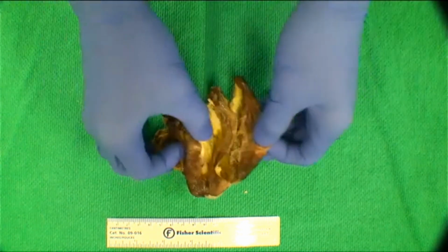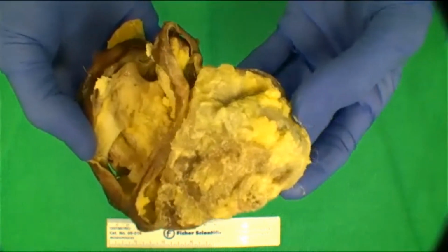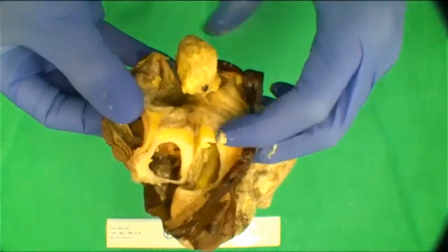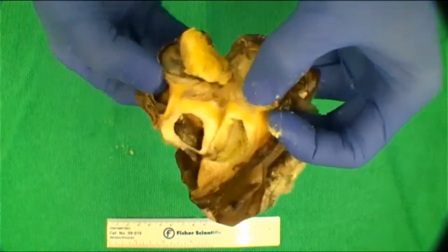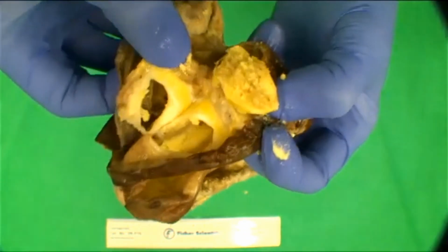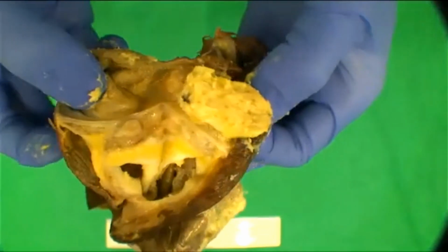So going back to our specimen, once you open it, you want to talk about the cyst contents like you would in any other specimen. And looking at this, you've got lots of this sebaceous sebum, but you also start moving across into some more solid areas. And here, a lot of these projections will often have a skin-like appearance, will often have some hair sticking out of it. Can anybody tell me what this nodule or protuberance inside the cyst here is called? Yeah, this is a Rokitansky nodule or Rokitansky protuberance.